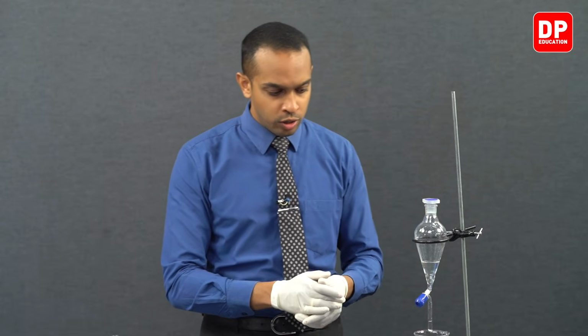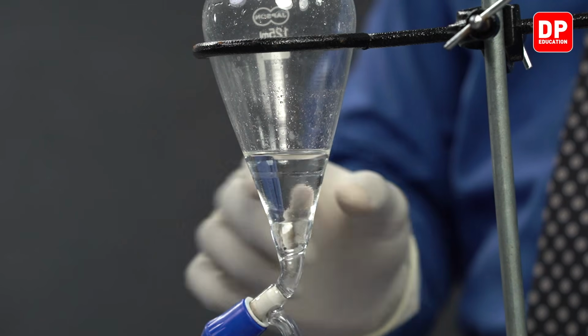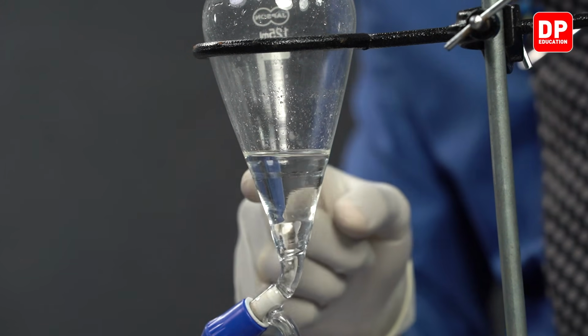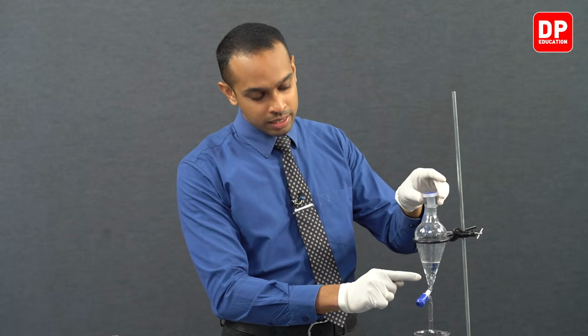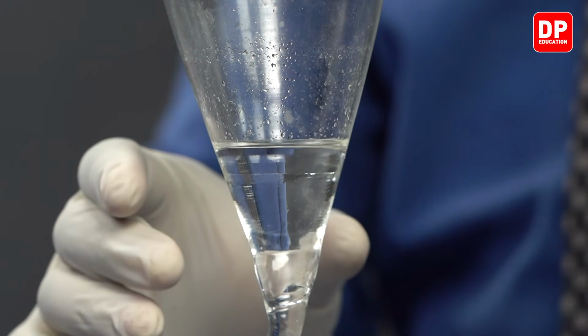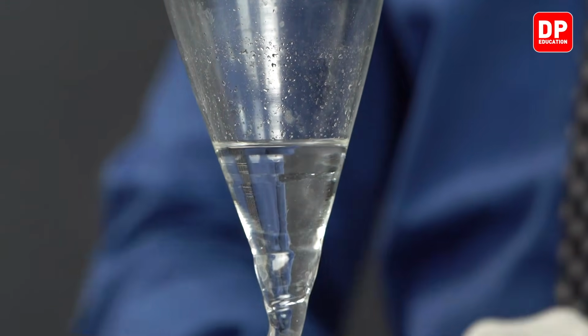Now at this point you can observe there are two layers here. The top layer that you can see over here is your diethyl ether layer, and the bottom layer is your aqueous layer. So I hope you can very clearly see those two layers here, and the aqueous layer is now very clear due to the majority of the essential oil dissolving in our diethyl ether layer.